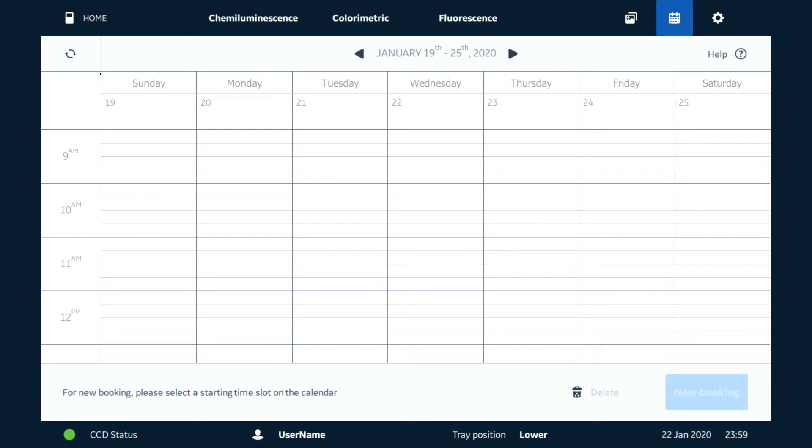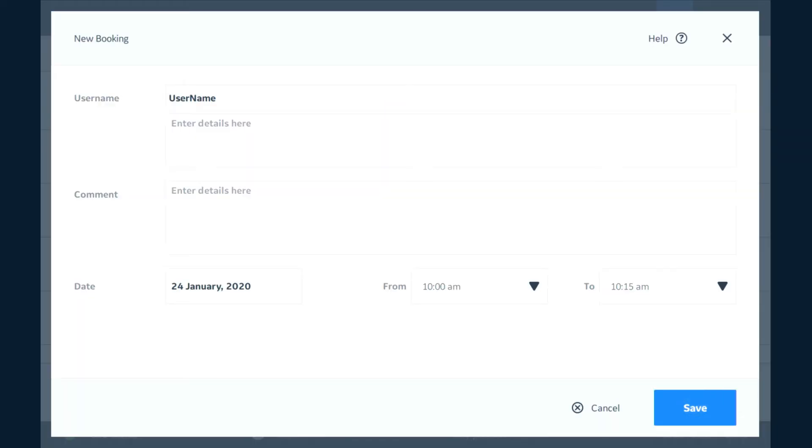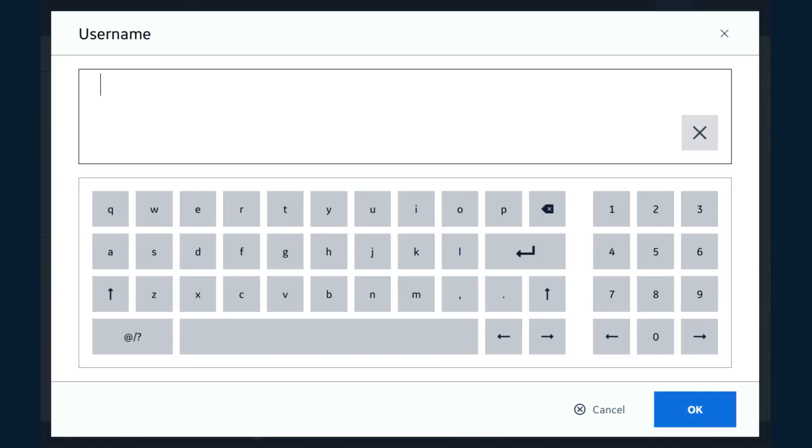We're going to click on the screen here and we're going to create a new booking. We can enter some details about what we're going to be doing. So in this case I'm going to do a chemiluminescent western blot.